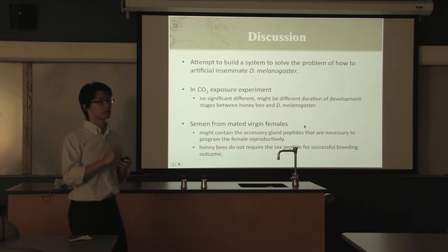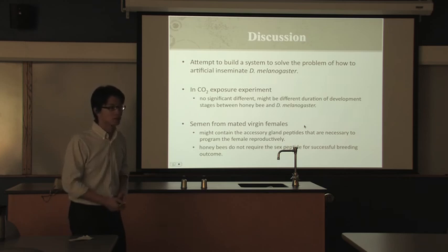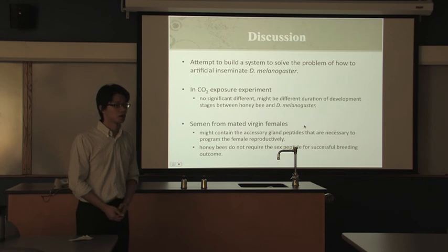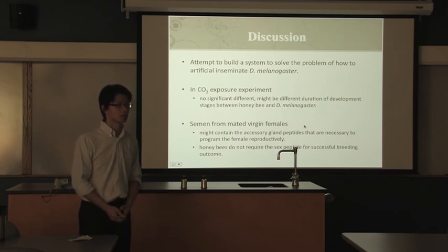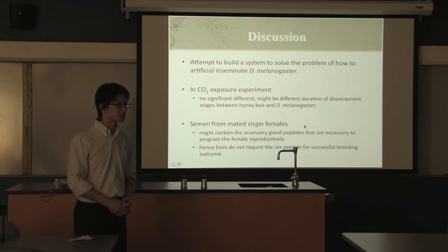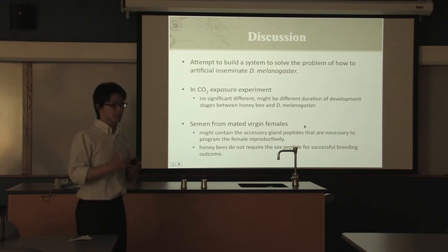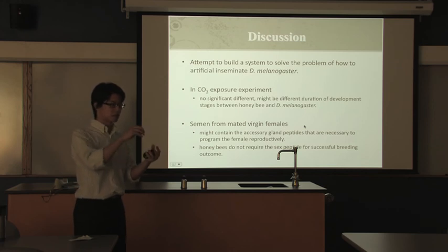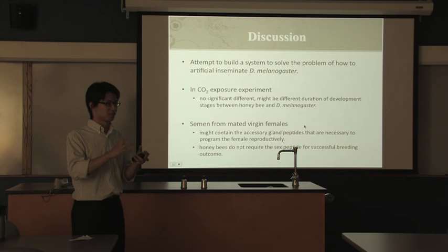I'm just wondering if you had left the pipette in for a longer period, because the copulation period is 10 to 20 minutes, if that might have increased your chance for success. Yeah, but if we put it in longer, maybe we will kill her. In the beginning I tried very deep and sometimes a little longer, but maybe this will kill the female.